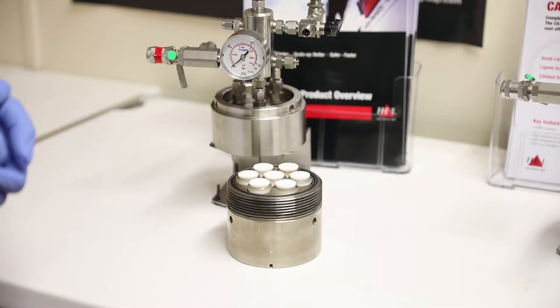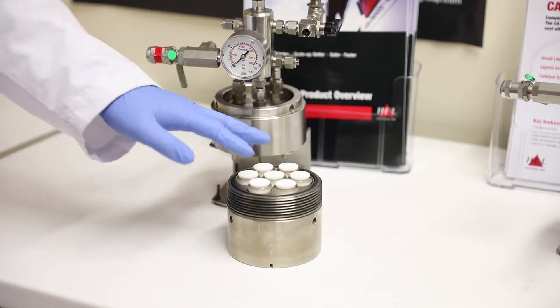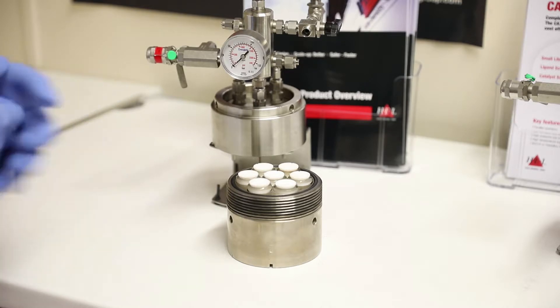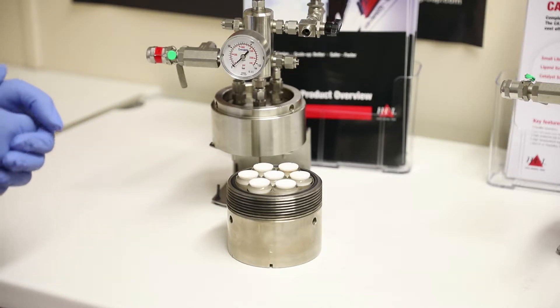Firstly, we have our CAT 7 system. Like all the CAT blocks, this is a single autoclave with multiple vials within it. This is rated to 100 bar and is available in stainless steel 316 or Hastelloy C276.